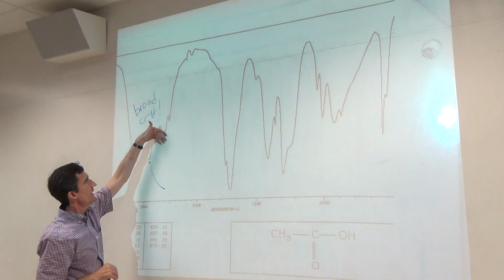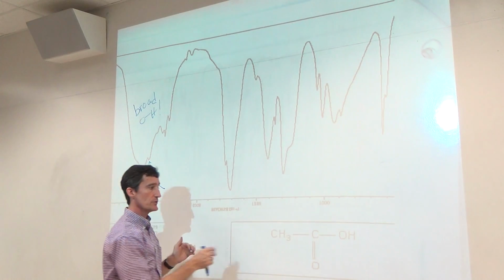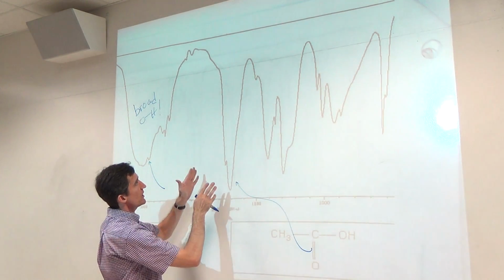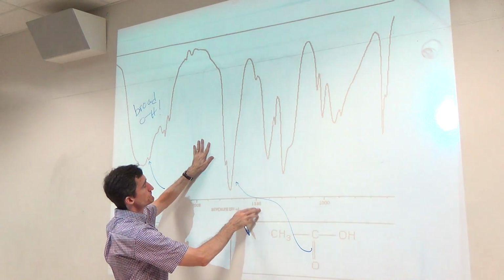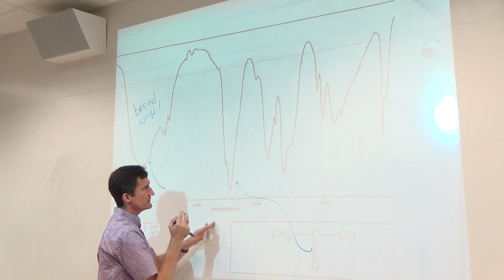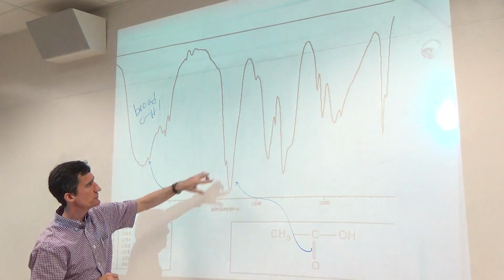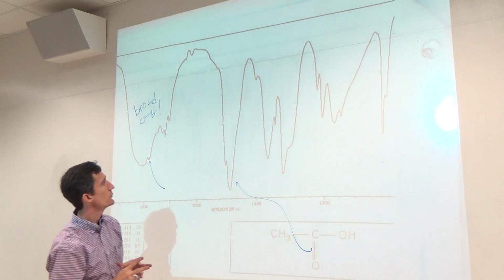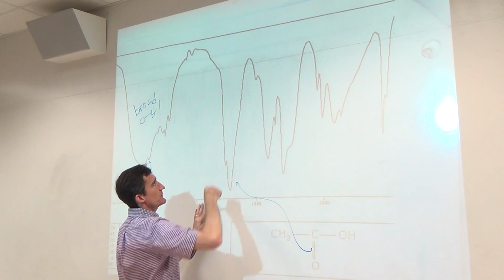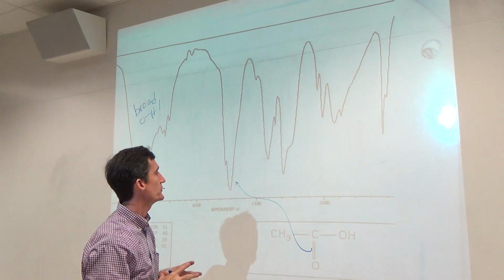This is a bit odd to have these fine details here. Other than that, you do still have the carbonyl. Here, standard carbonyl, this one is a bit wide, or broad, at about 1700 to 1720. Got a little ridge on it. Not quite sure why, and I'm not sure that's relevant. The rest, pretty much fingerprint. You can really see it's not aromatic because we don't have these sort of sharp peaks in the 1500, 1600 region.